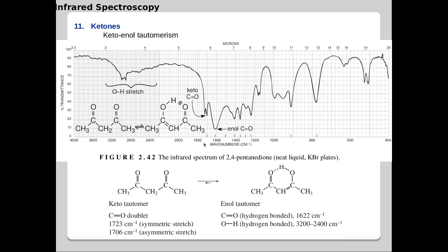Okay, and you shall see the band at around 1400 to 1500 cm⁻¹ due to the stretching vibration of the C=C bond in the enol tautomer. And you shall see bands due to sp3 C–H bonds that come around 2800 cm⁻¹ right here, which are weak bands. Then sp2 hybridized C–H comes around 3000 cm⁻¹ here, which overlaps with the OH stretching frequency.